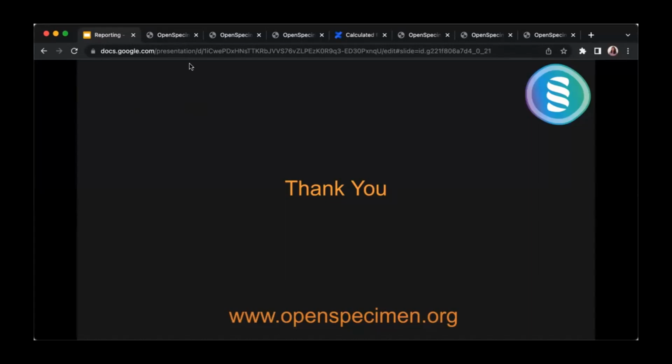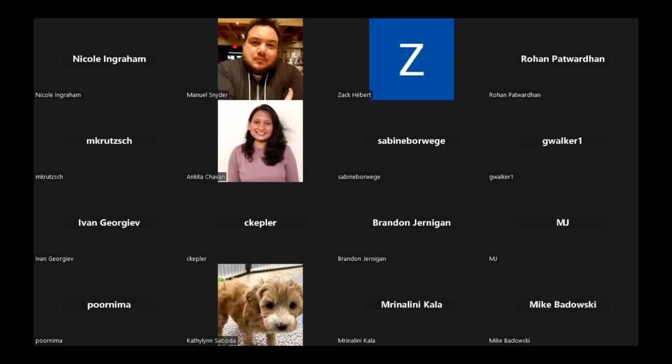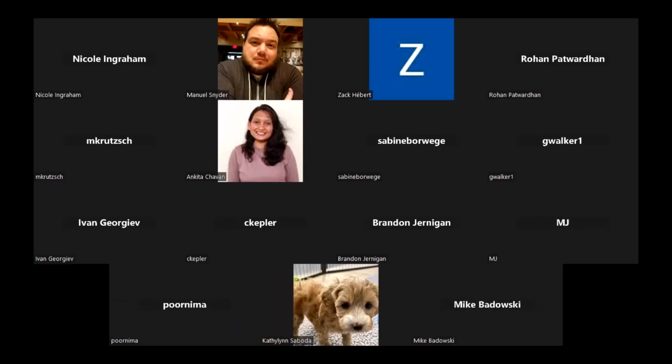Okay. If there are no other questions, is there anything else apart from this particular topic you want to discuss? Yeah, so the queries we showed today, we'll create a training folder and add those queries to the training folder and share with all users. So you can log in and try it out and let us know if you have more questions. You can also try creating new queries for your requirements and let us know if you have more questions.